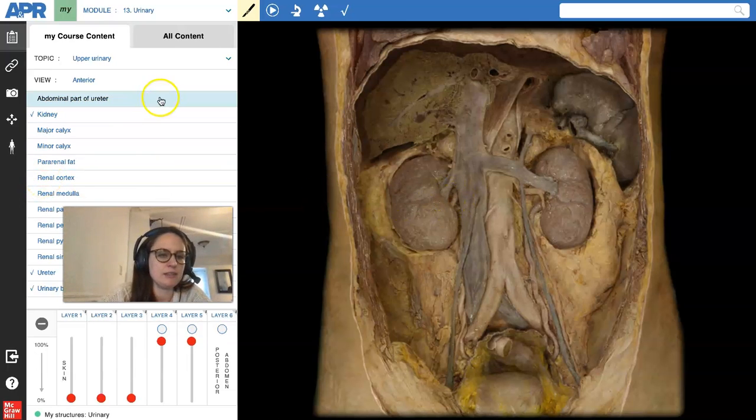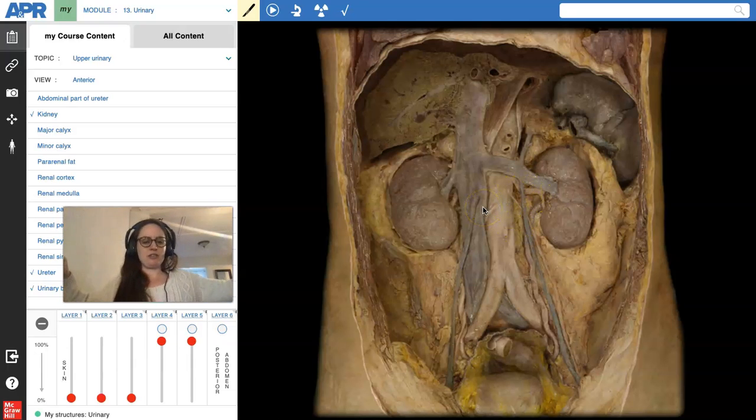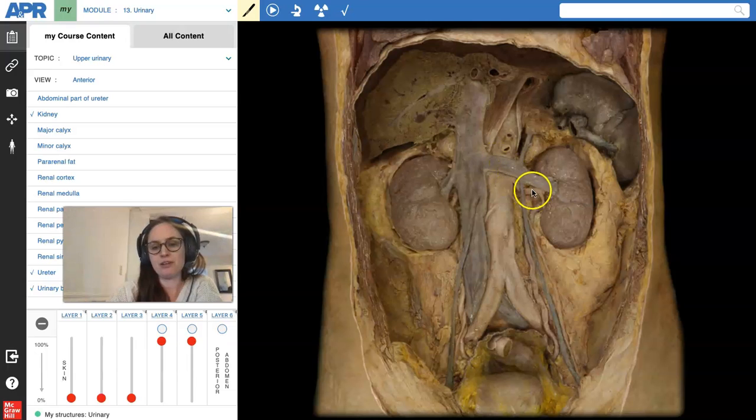I think there's another view where I can get those blood vessels highlighted, but I'm happy with just showing them to you. They always look like two tree stick figures, like from an early Disney animation, just hanging out with each other, like legs right here, bodies, arms sticking into the kidneys right there. So body, arms, kidneys, legs. I always see it that way. I can't help it. So again, you do have renal veins and renal arteries on your list. They're just under cardiovascular structures.